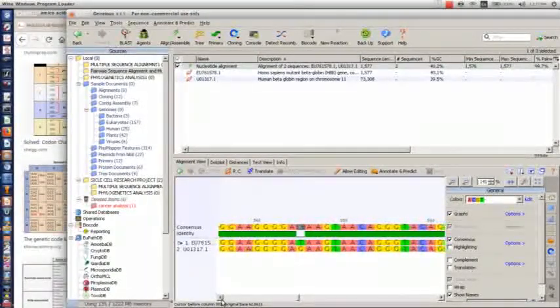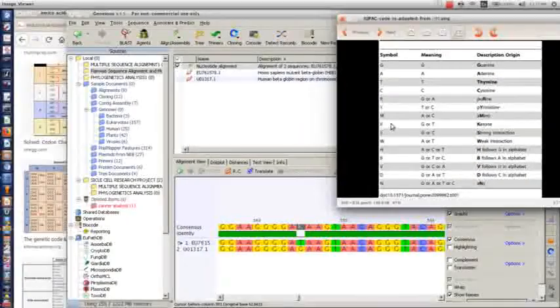So now here we have K, and we have a gap here, which signifies there's a mutation. Then you go to the normal sequence, we have G, and in the mutant sequence we have T. That means T was substituted in the mutant sequence instead of G. K signifies either G or T, and in the normal sequence we have G. So what's supposed to be in this consensus sequence is G. Are you getting it now? What was mutated was G, and it was replaced with T.